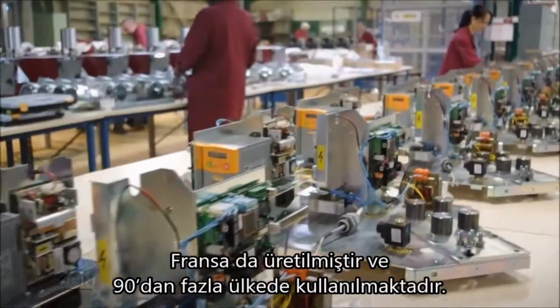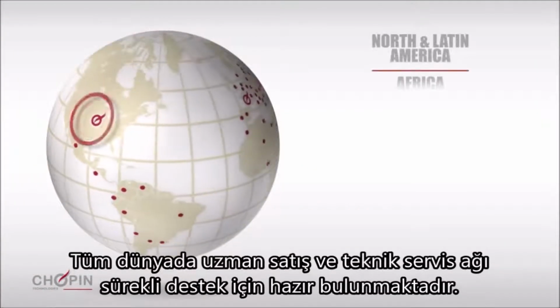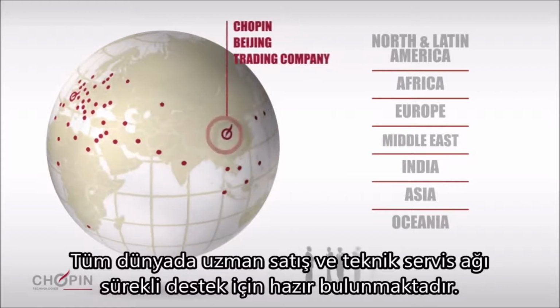Made in France, the AlveoGraph has a customer base in over 90 countries. All across the world, technicians are available to train users, carry out maintenance and support equipment, and provide a rapid response to ensure quality analysis.